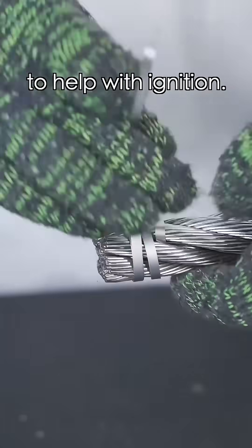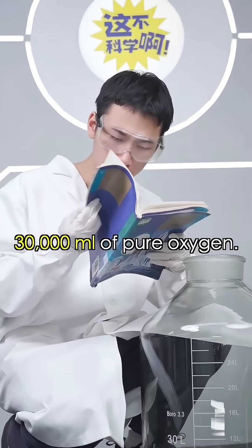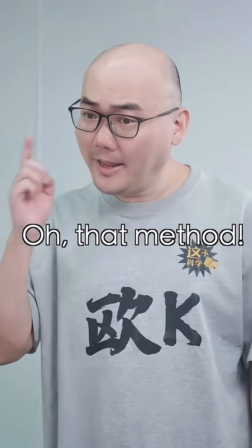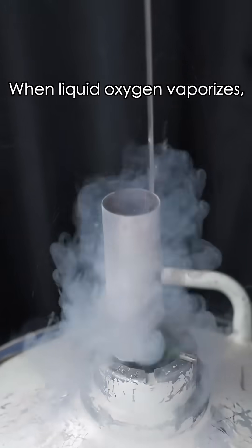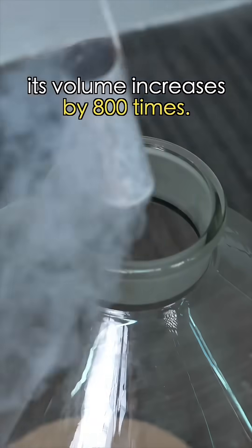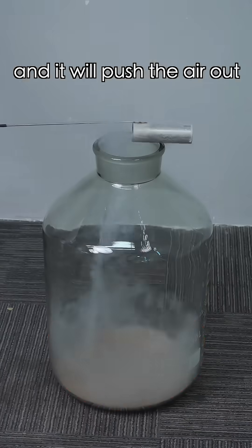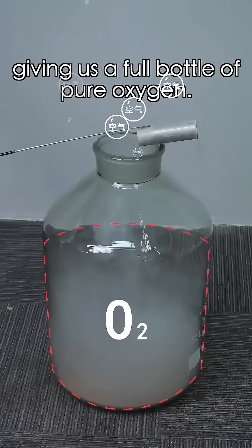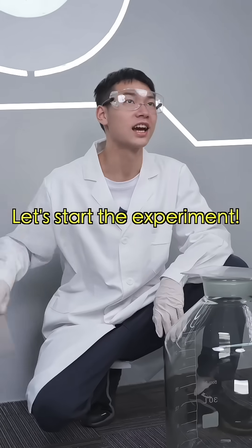So heavy! Also, we use a magnesium strip to help with ignition. Lastly, we need to figure out how to quickly collect 30,000 milliliters of pure oxygen — and that method is the answer. When liquid oxygen vaporizes, its volume increases by 800 times. So we pour it into the glass collection bottle and it pushes the air out while vaporizing, giving us a full bottle of pure oxygen. Security test — it's full! Let's start the experiment!